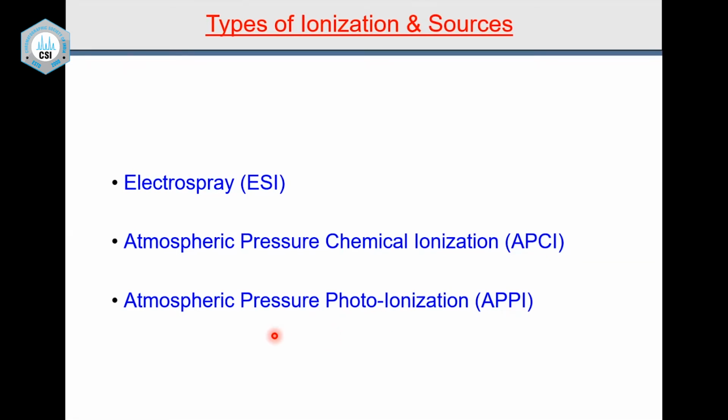We are very lucky today that we have the ability to use all these ionization techniques depending upon the type of samples you have. In most organizations, in general, electrospray is a must. It can work with low molecular weight compounds as well as high. So when you are buying an LCMS, please make sure that you have electrospray ionization, otherwise don't buy an LCMS. Then atmospheric pressure chemical ionization can be an accessory, and this can be an accessory.